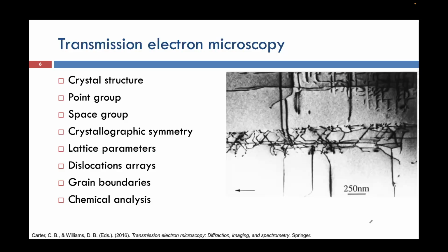So this is an example of a transmission electron micrograph, and this is also an extremely good example of the depth insensitivity of a transmission electron micrograph. Here we cannot say that this top portion, where I am writing T, is the top and this is the bottom portion.